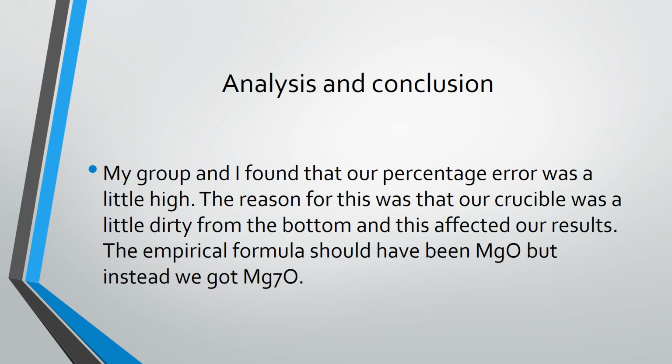For my analysis and conclusion, my group and I found that our percentage error was a bit high. The reason was that our crucible was a little dirty on the bottom, and this affected our results. The empirical formula should have been MgO, but instead we got Mg7O.